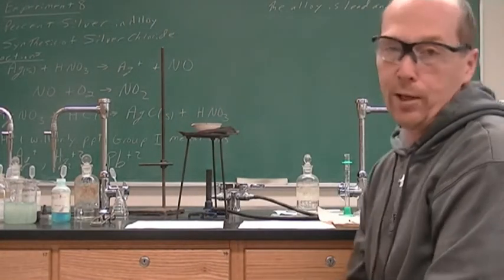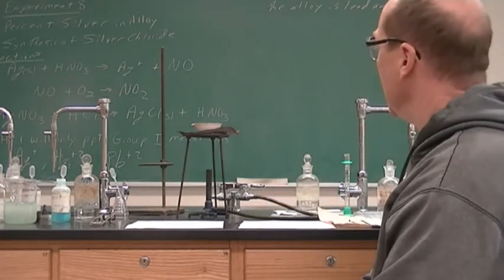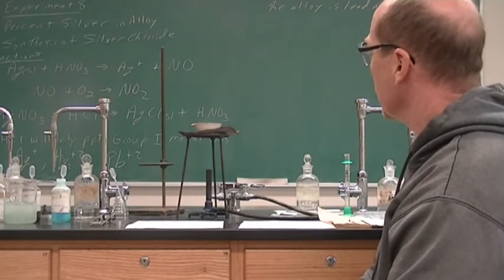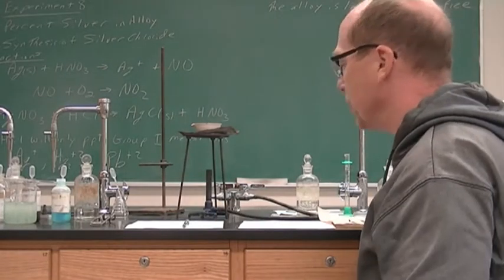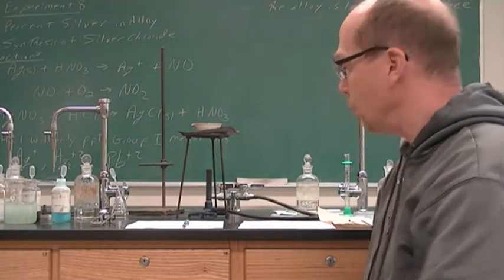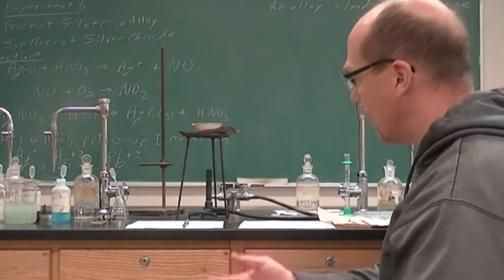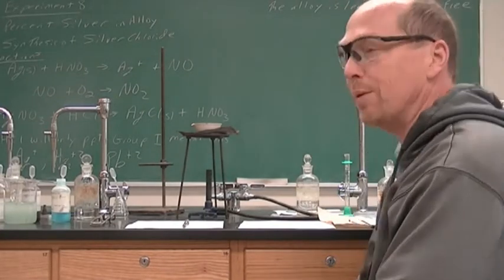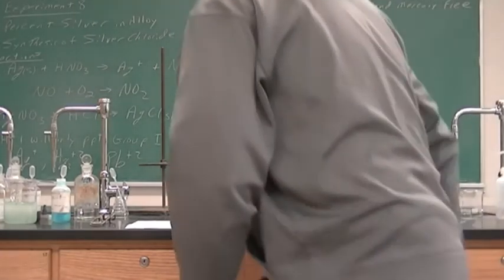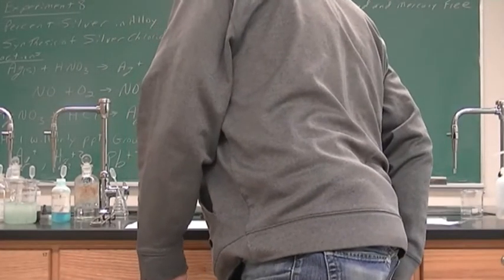All right, so again, we are boiling again. So you again have a fast forward button. So you can fast forward to it's now dry and we're weighing it. But again, this gives you what lab is really like. It's not just automatically dry and then there's your mass. You have to dry it, you have to do things carefully. So you shouldn't be fast forwarding, you should be watching. All right. To get the full lab experience.